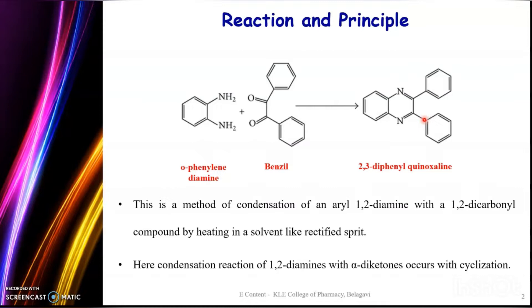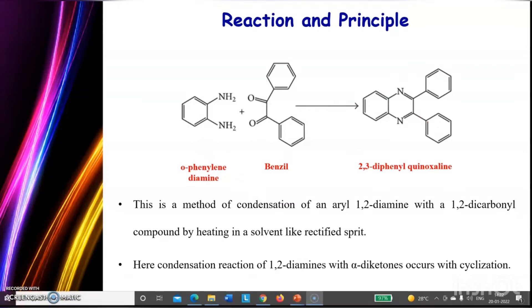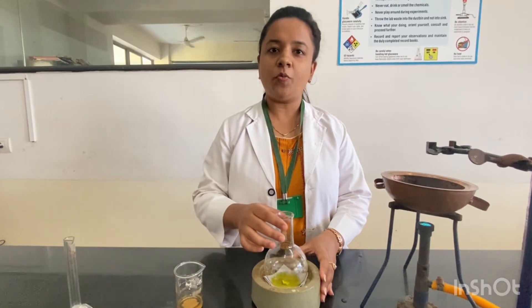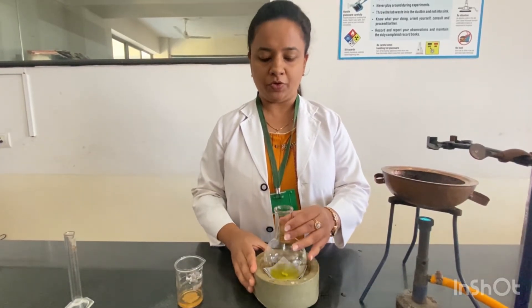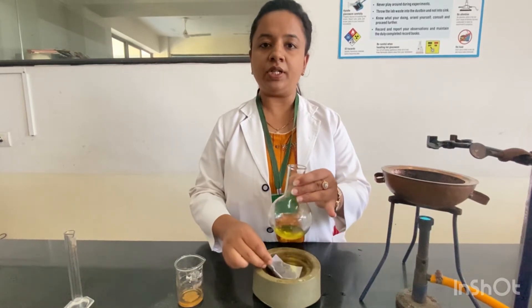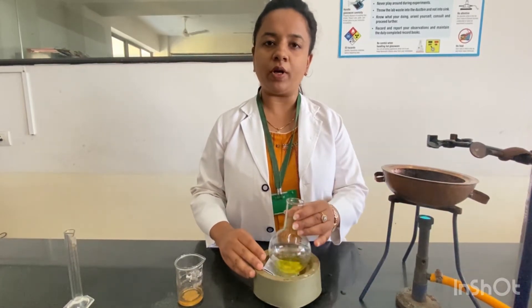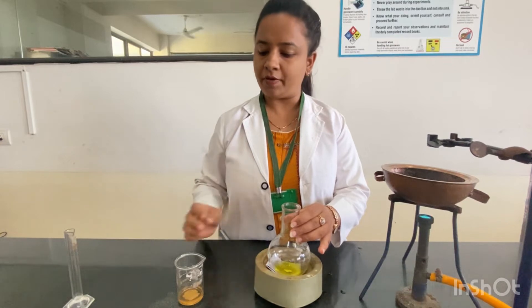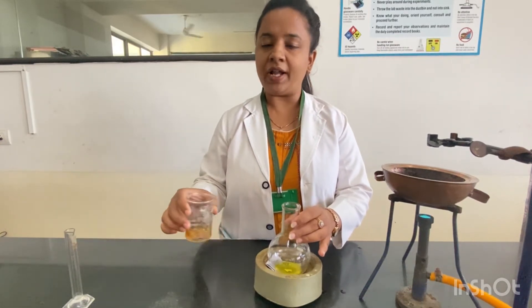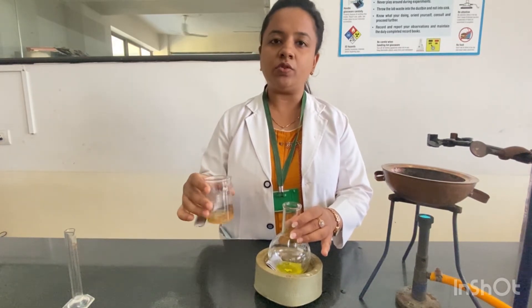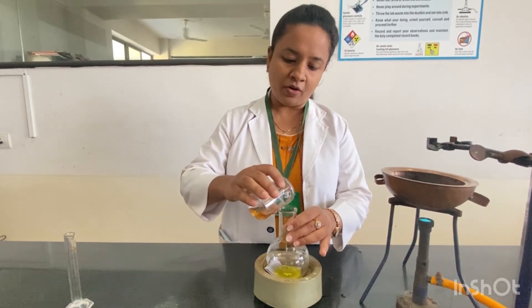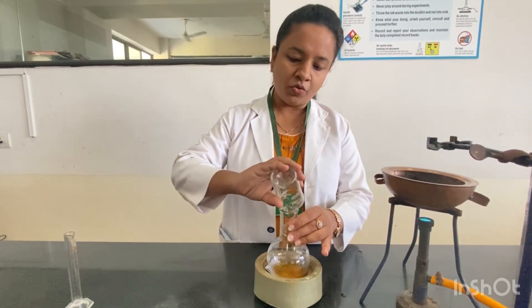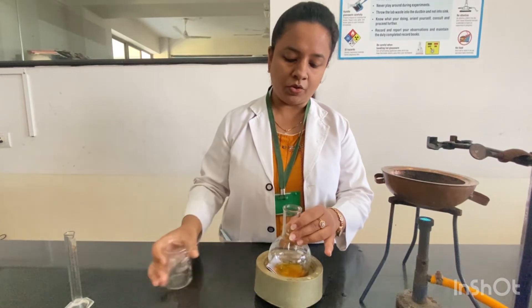Let us move on to the practical procedure of this synthesis. Our first solution is a warm solution of 2.1 grams of benzyl and 8 ml of alcohol. To this we are adding our second solution which is 1.1 gram of orthophenylenediamine and 8 ml of alcohol. We are going to mix both of these two solutions.